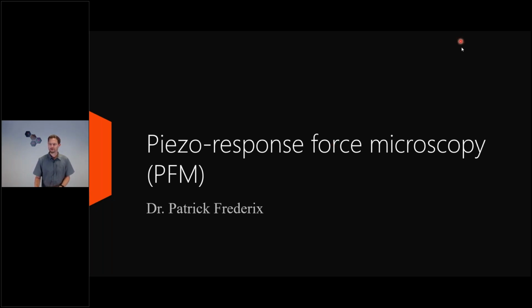Let me get started immediately. So today's subject is piezo response force microscopy, abbreviated PFM, and I want to go into some of the background issues and some examples of this method.